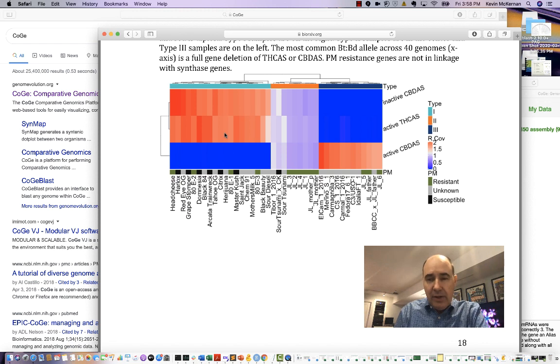The data's there in your sequencing data, but our software tools haven't gotten smart enough to go in there and identify the variants and decide which one's really damaging and which one isn't, to give you like a 23andMe report on every single base. We're building that right now, but in the meantime, we want to enable you to load this stuff into the CoGe Genome Browser and surf it yourself.